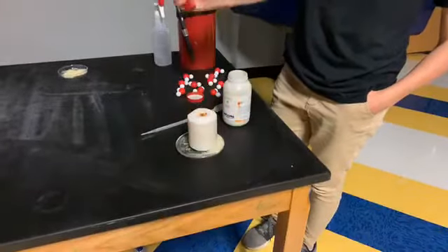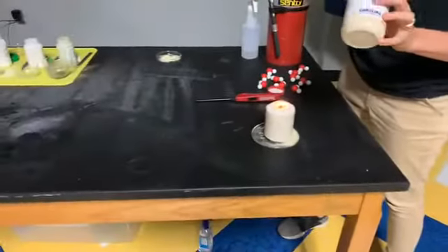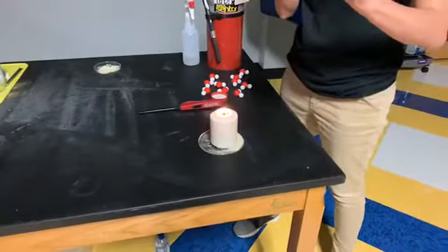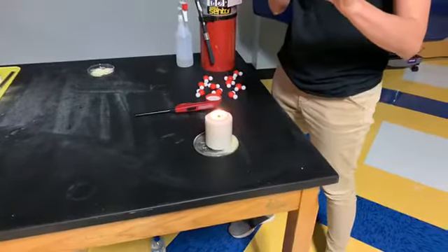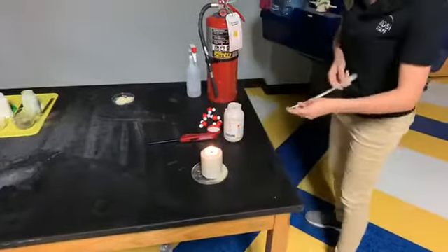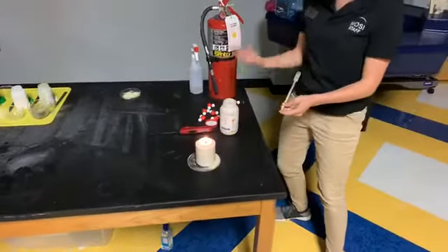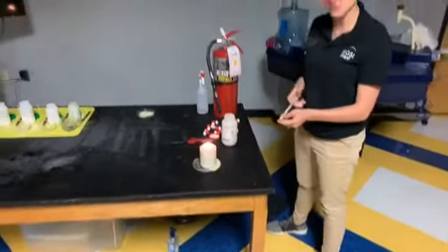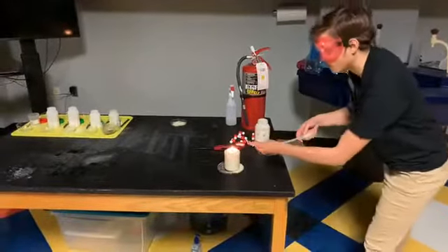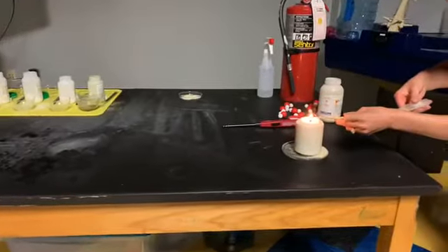And I'll light this candle here. I'm going to add some lycopodium to this pipette that I have. And what I'm going to do is I'm just going to push this out over the flame, and that's going to allow the lycopodium to spread out a little bit, let those oxygen molecules get in between, and we'll see if we can get it to light now. Are you ready? Count down with me at home. 3, 2, 1.